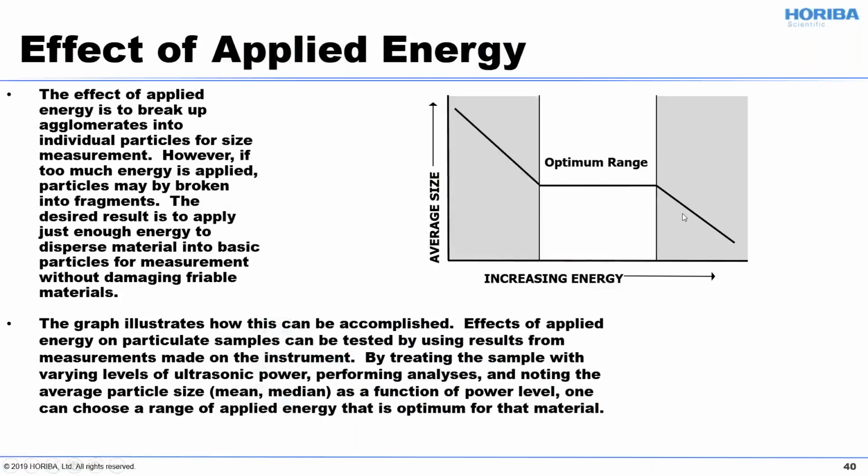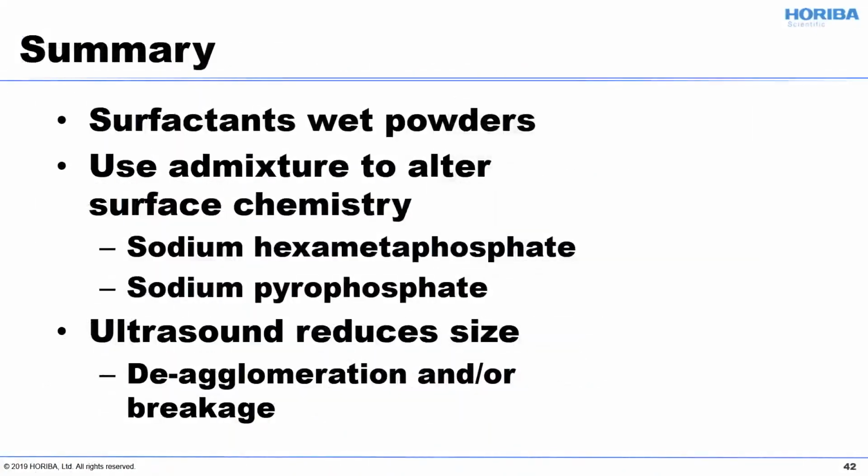This softens out a lot more than you really want to. It's not as obvious. And you'll start looking for things like what gives me the most repeatable result, because that is also important. So in summary, surfactants will enable powders to be wetted.